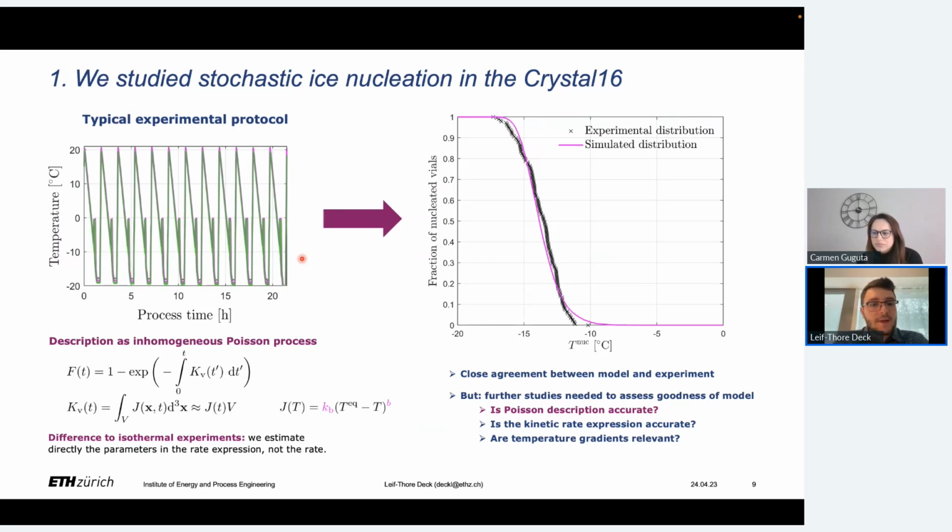The problem that you have with crystallization is that you have to do these experiments under isothermal conditions. So it's not like we cool down here with a constant cooling rate and can be sure that one cycle is finished in an hour or so, because we know if we get cold enough, nucleation will happen, right? But you have to crash cool to a certain temperature in crystallization, and you hold there. And it can be that you have to hold there for hours until nucleation happened everywhere. So typically, a single experiment for crystallization takes maybe 2 or 3 times more time than what I showed here. So we can actually get more data with this approach.